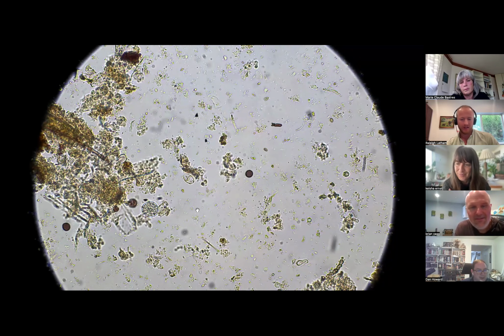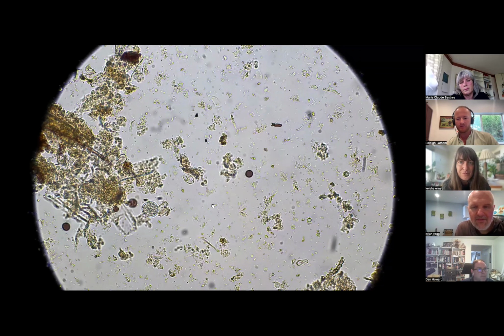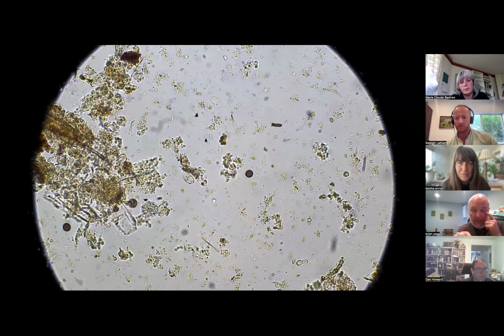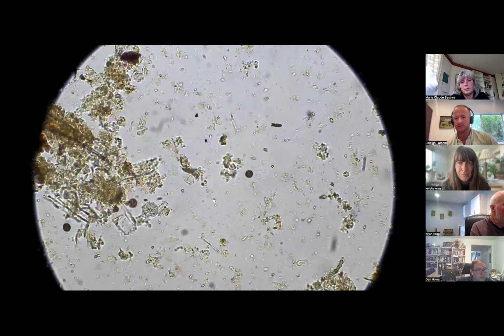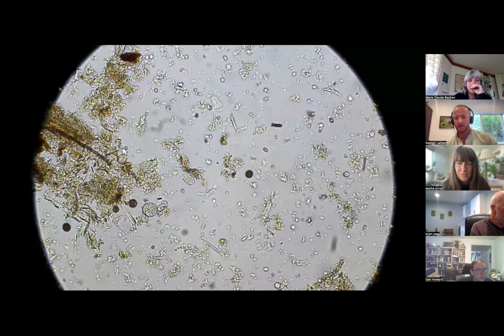Yeah. That's it. I had a question. For folks who are interested, the way that we're going to be teaching qualitative analysis, why don't we give people a small introduction to how we're doing that in the microscopy program.